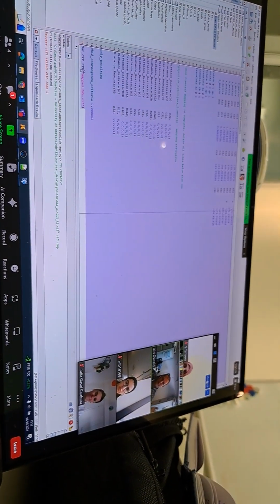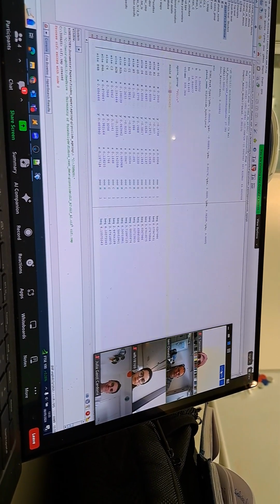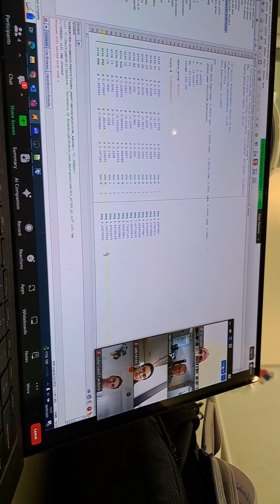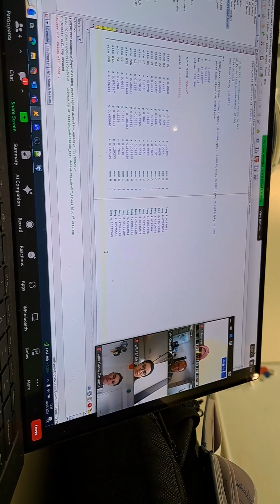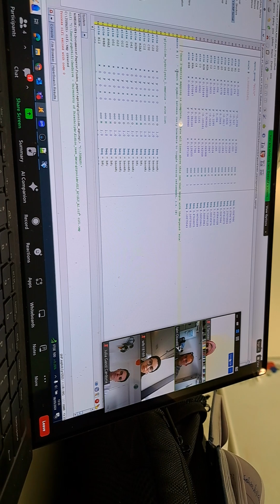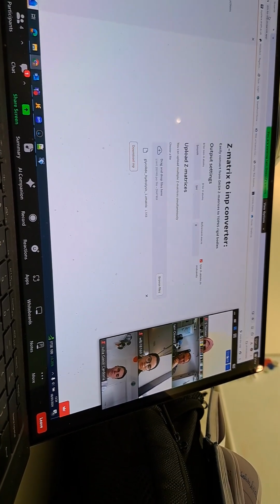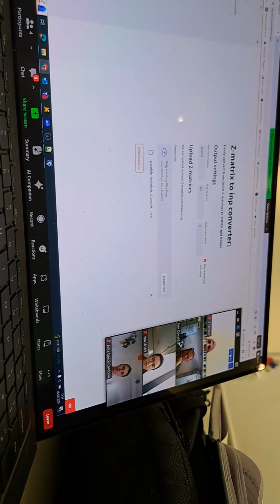Oops. Right, so I'm going to go and copy that, and I'm going to go and put it into my blah. Okay, so I'm going to do as the instructions say and put all of this information below where my refinement was. Okay, my refinement, if we go back to that thing, the instructions are here somewhere.